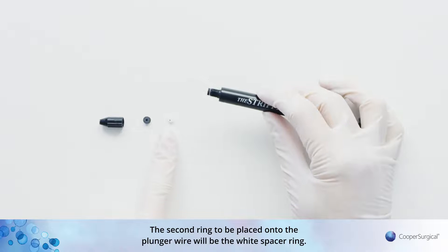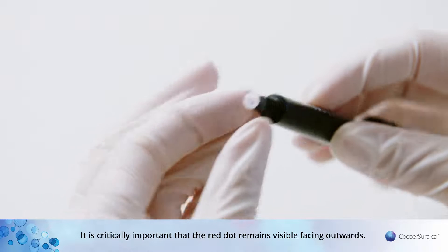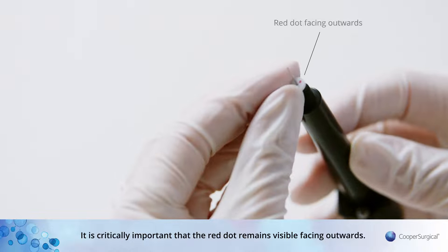The second ring to be placed onto the plunger wire will be the white spacer ring. It is critically important that the red dot remains visible facing outwards.